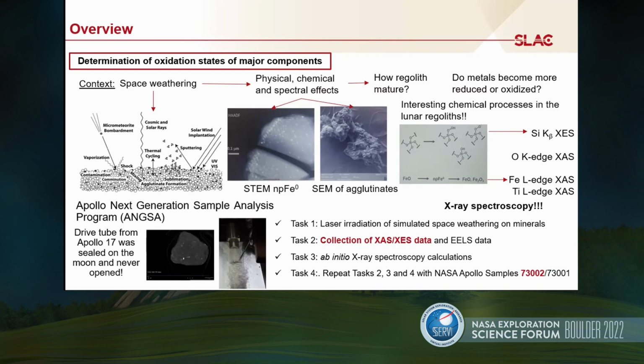For this, I will be using soft X-ray spectroscopy, but also some tender X-ray emission analysis, focusing again on oxygen, titanium, iron, and silicon. We have a set of different tasks. We started this part of the project performing some laser irradiation on simulated space weathering minerals.